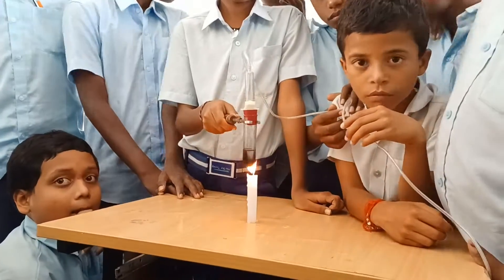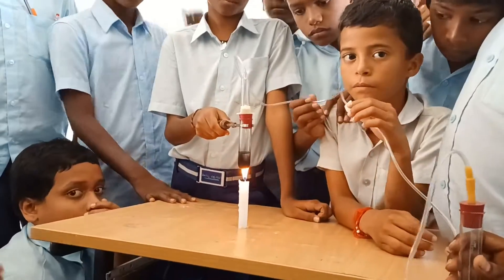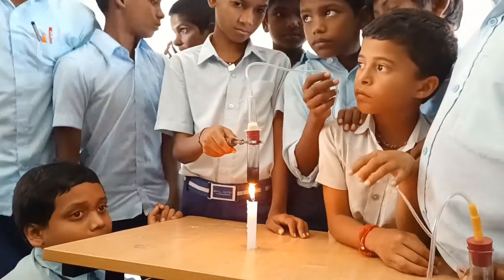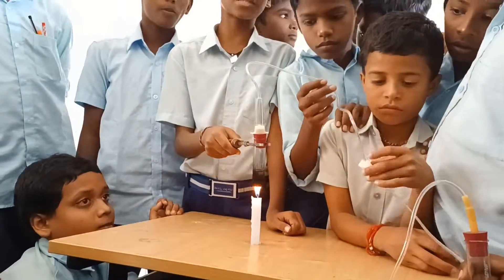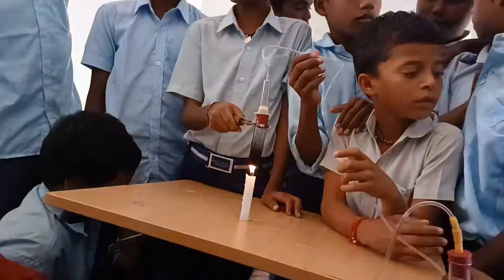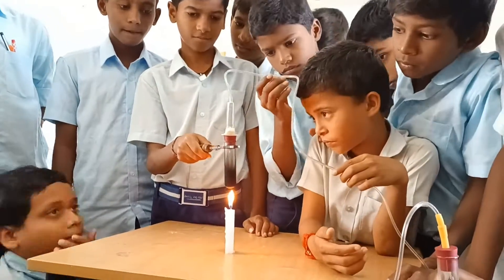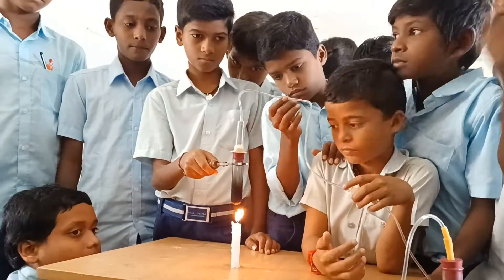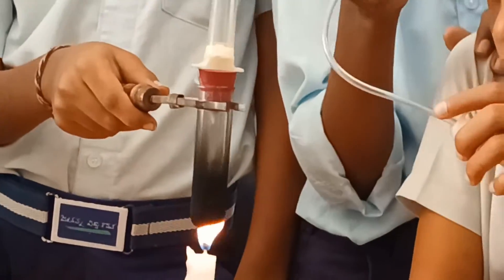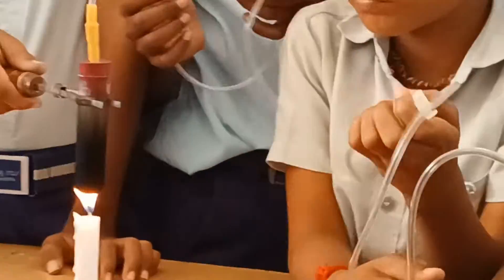They closed this test tube with a cork having a hole, and took another test tube with a cork also having a hole. They connected these two test tubes with a delivery tube. Then they heated the test tube containing water using a candle.